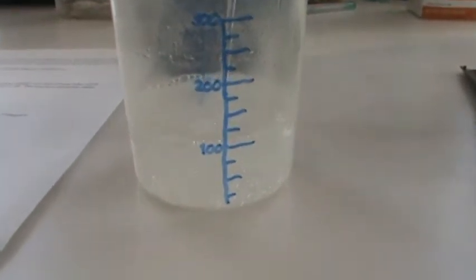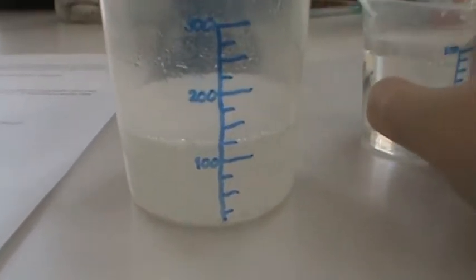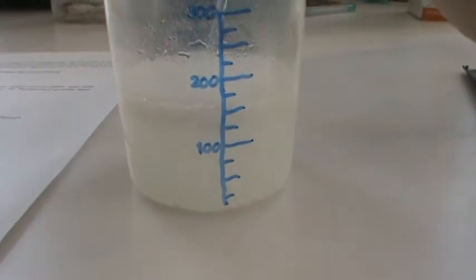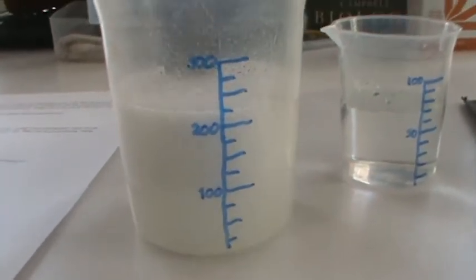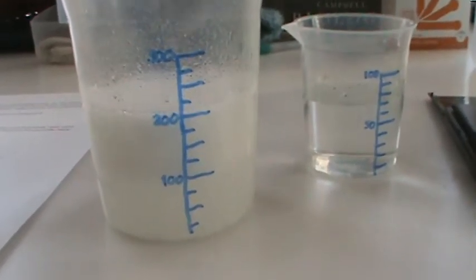Now you can see that there's still some baking soda in the bottom of this, which is why we still need some more. Well, let's take a look. And now I actually have a little spoon here that I'm going to use to agitate this. What I'm doing there is I'm just speeding up the reaction. It's basically what stirring it is doing.